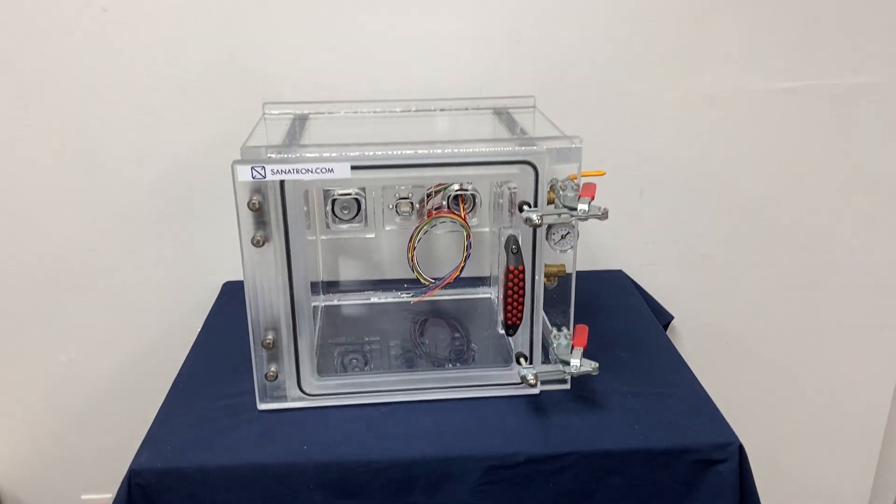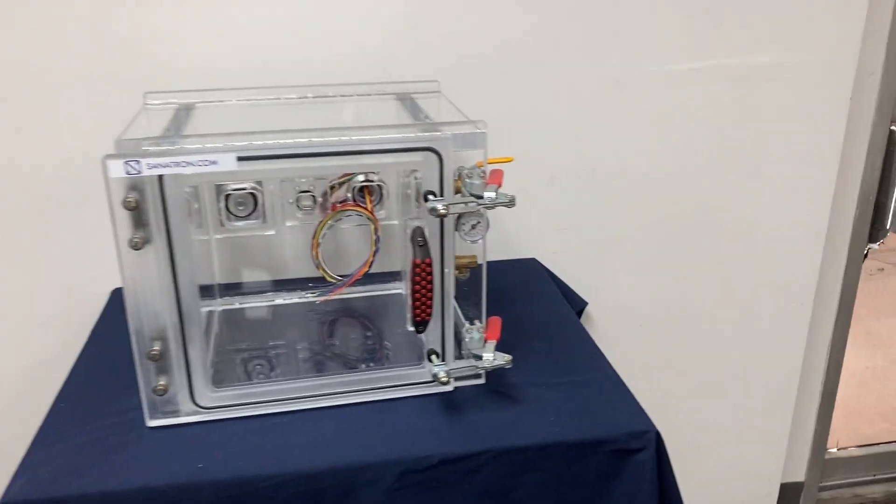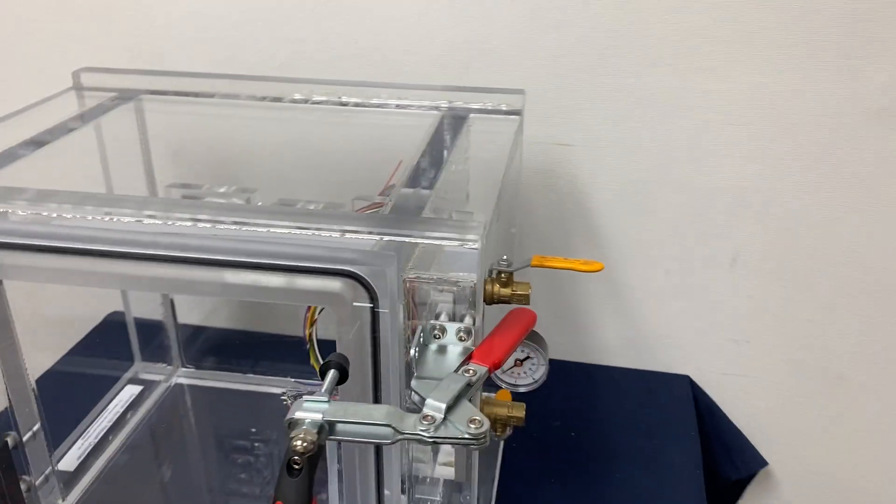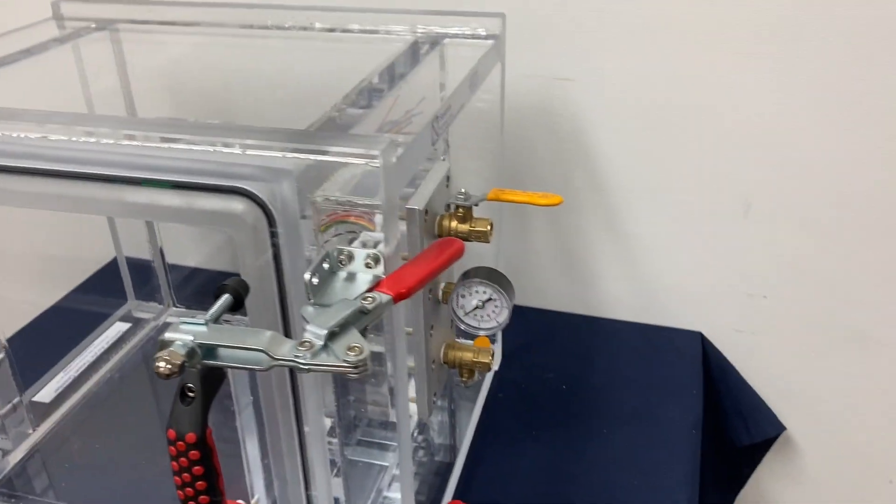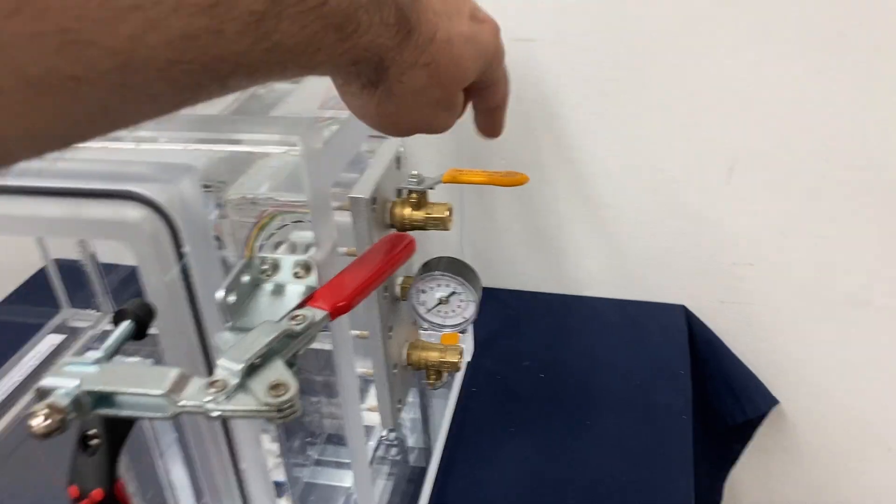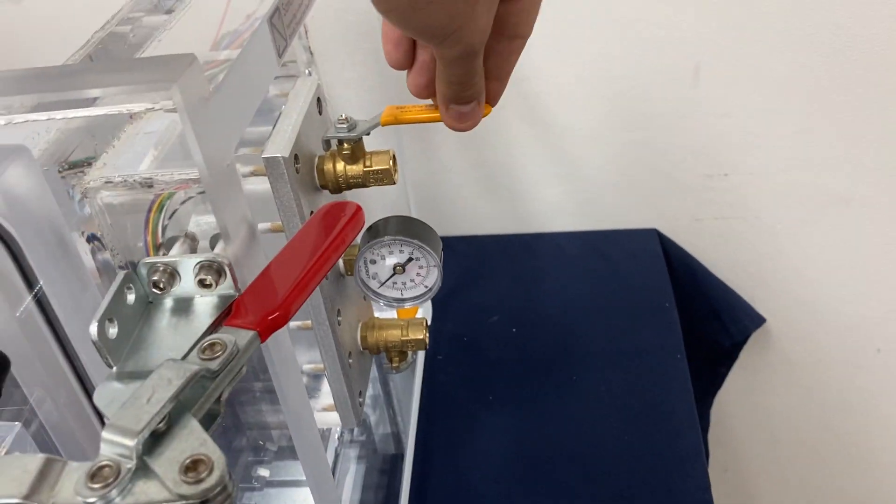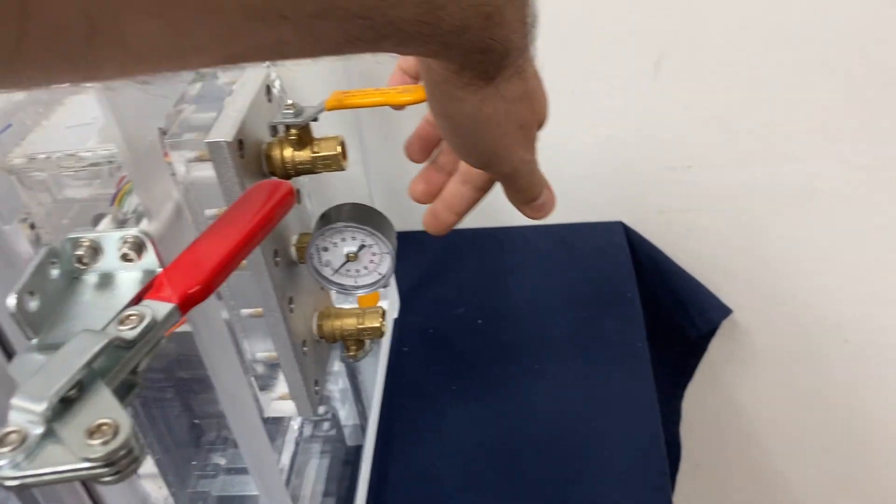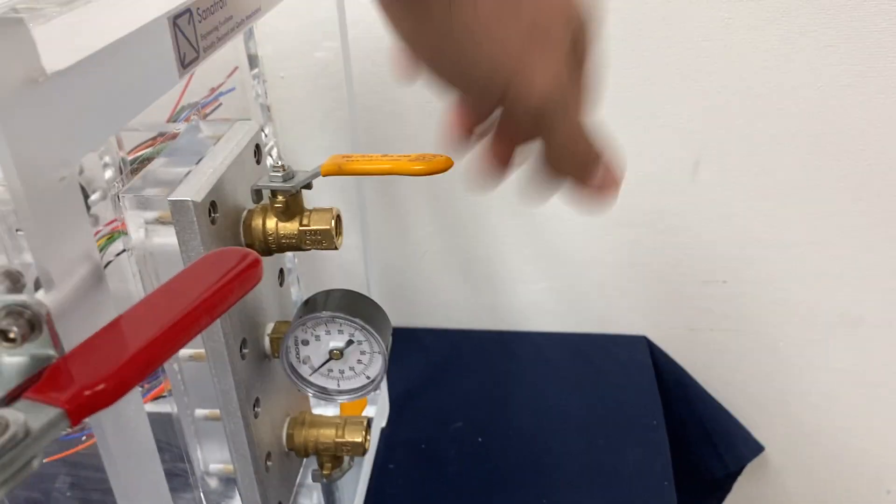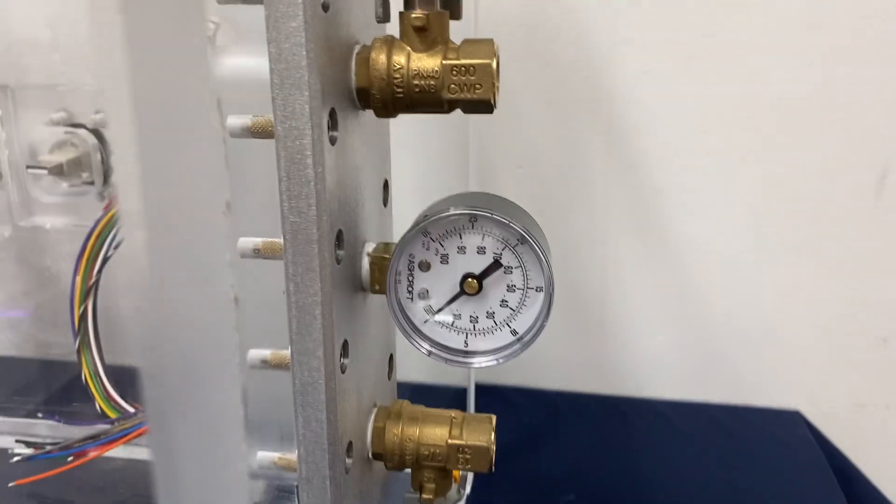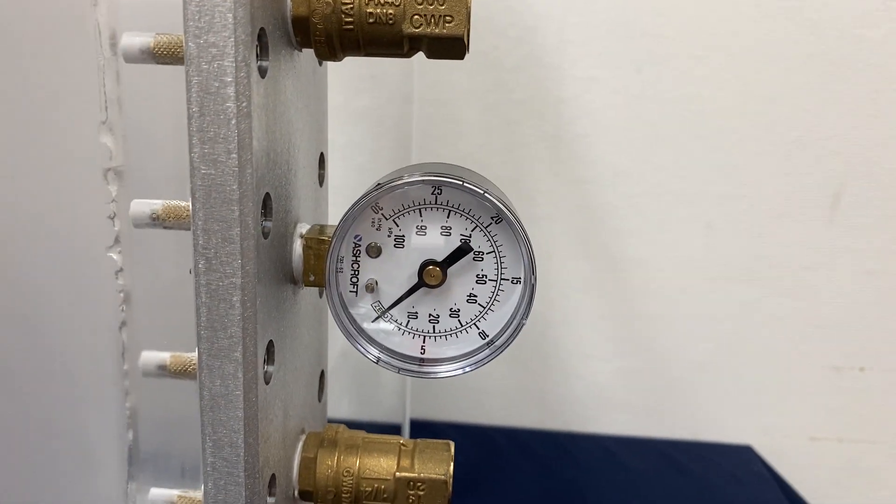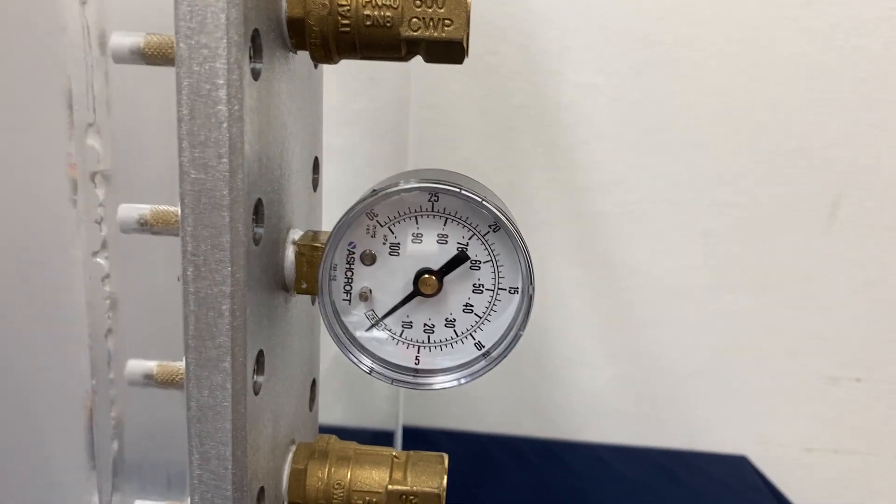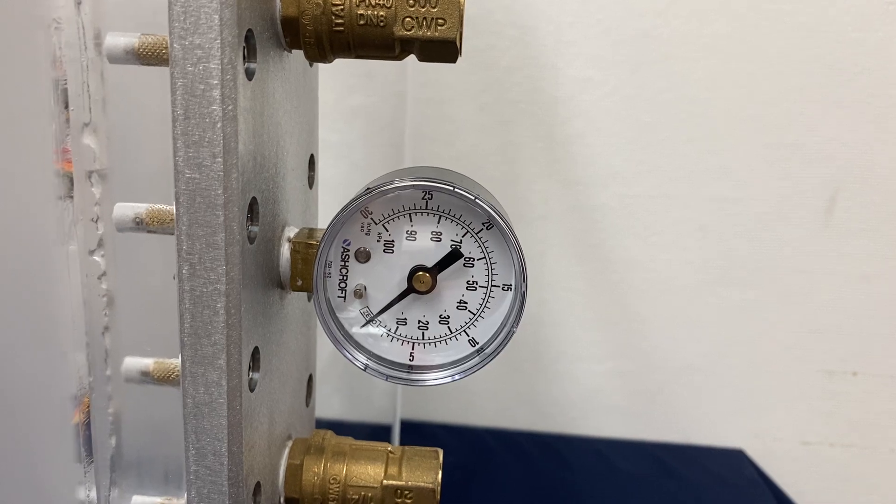Our standard acrylic 12 inch cube chamber comes with two valves—one is for venting, the other one is for the vacuum—with a dial vacuum gauge. This dial vacuum gauge is a dual gauge that shows in kilopascals and inches of mercury.